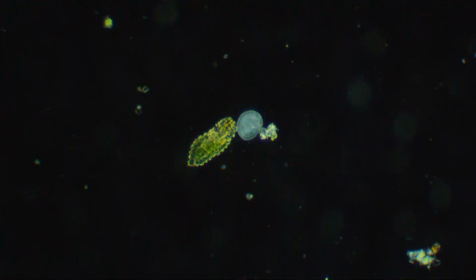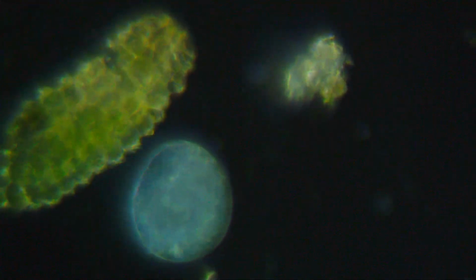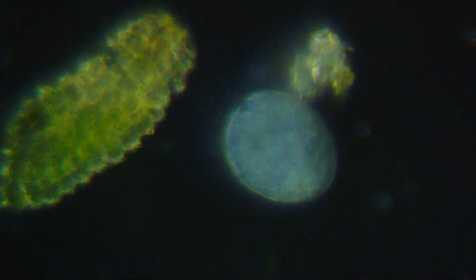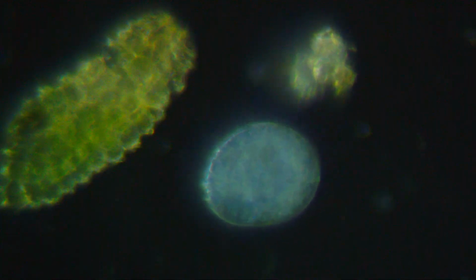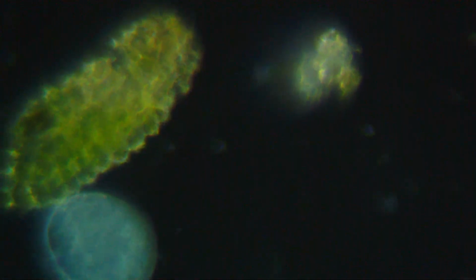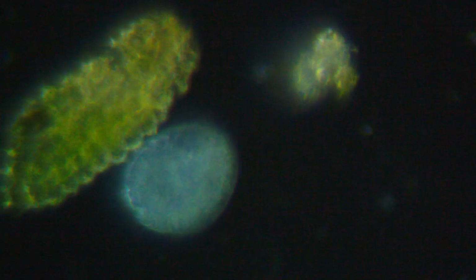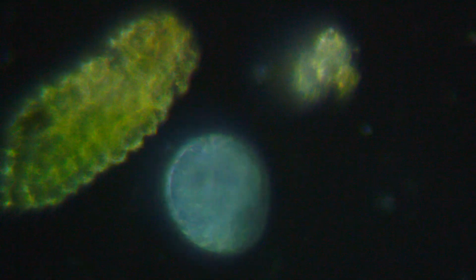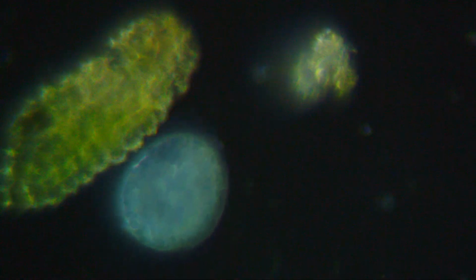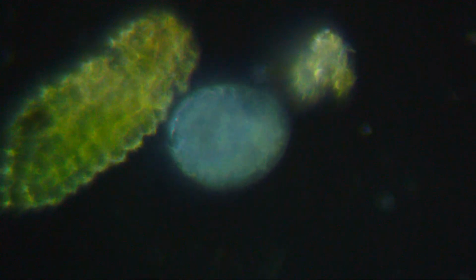All right. I'm going to go into the third objective on this guy. Let's see what he looks like up close. And just got to adjust the stage here. Well, that's not a rotifer. I don't really know what it is. You know what? He looks very similar to this one, maybe the Tetrahymena.